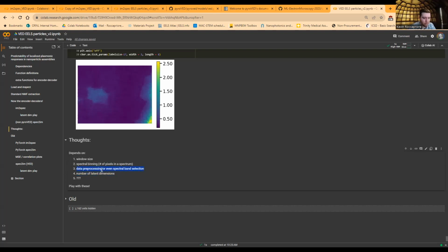So what I did not show, and I potentially can have that on request, is how we're getting the zero loss peak. We're always typically having that. How do we get rid of that? How do we do the background subtraction and the alignment of all the zero loss peaks? And there's a bit of pre-processing that goes into here, which potentially could have some impact on your final result, but hopefully it's not too much of an impact, as long as the fitting is reasonable.